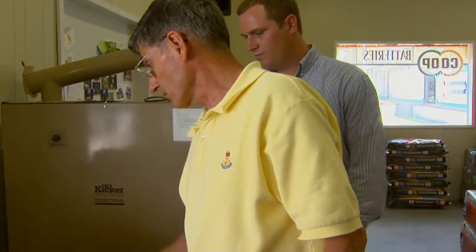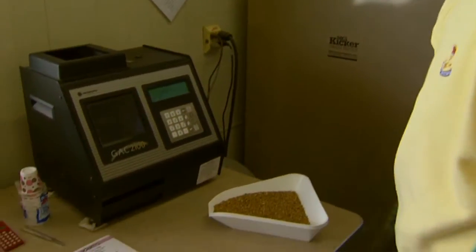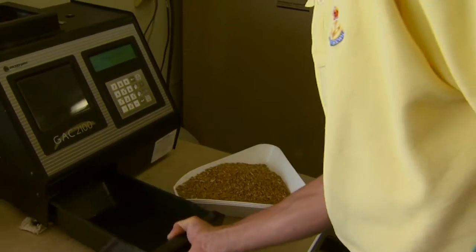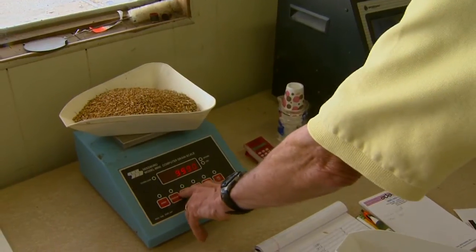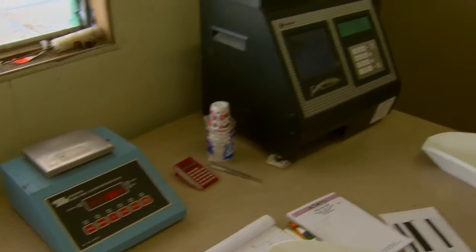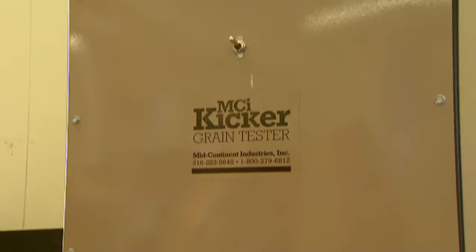You might also note that this says 58.8 pound test weight — but it's got the dockage in it, so that's underestimating test weight. What we'll do is take the sample out, add it back in. The sample weighs right at 1,000 grams, and then we'll run the dockage machine.